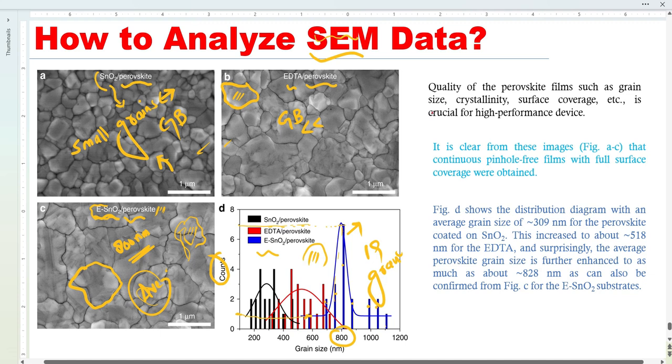Now let's get started on how to describe these SEM images in a research paper. We can write this sentence: Quality of the perovskite film, such as grain size, crystallinity, and surface coverage, is crucial for high-performance devices. This is very important. If you do not have fully covered surfaces, there will be leakage of current, so there will be instability.